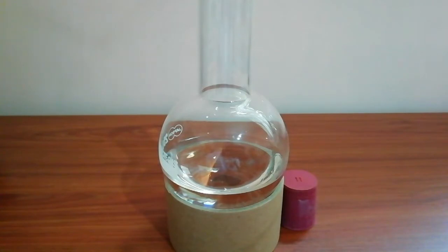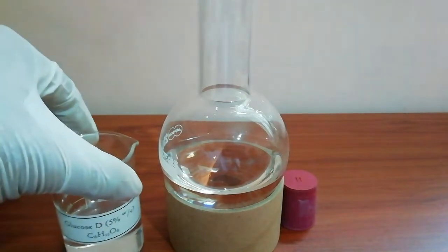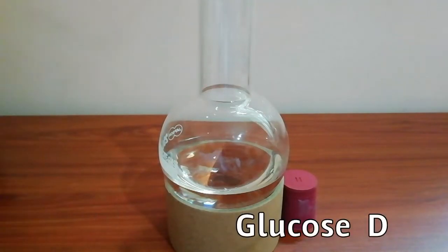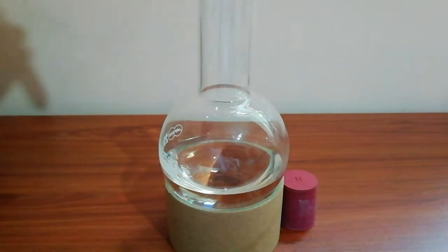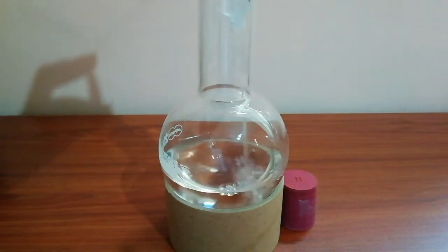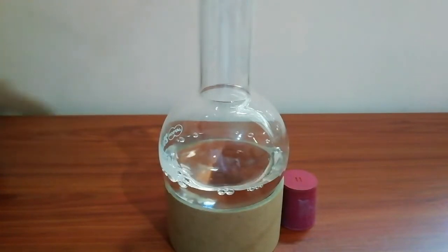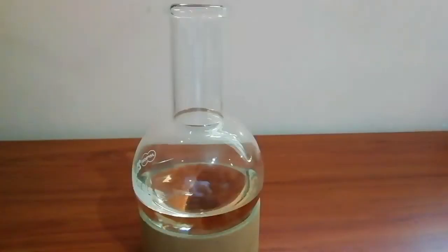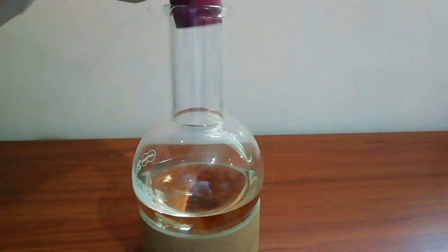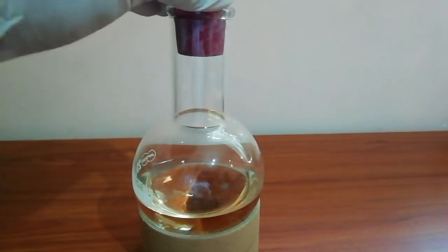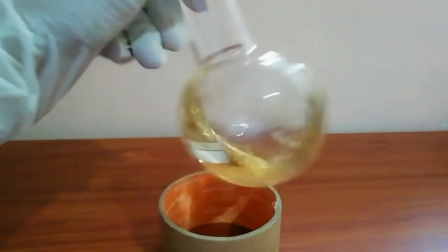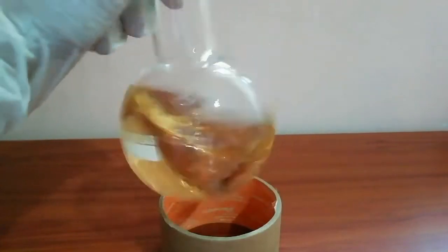For the final step, we need to add 10 milliliters of 5% glucose solution. Now we need to shake this flask well until the silver mirror forms.